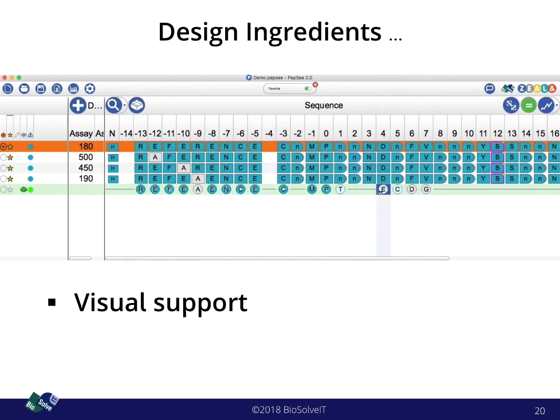So you can see as I shift these around, the color of the residues change, and that alignment is evoked with the control key or the command key on the Macs, while you shift the sequences from left to right like pearls on a string. And with this, you can relatively quickly go forward, designing your next sequence that you would like to work on or to perhaps synthesize later on.